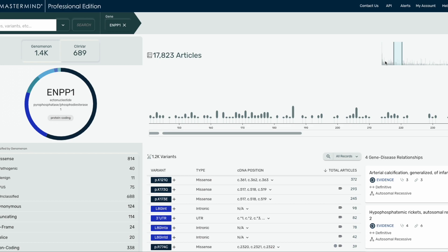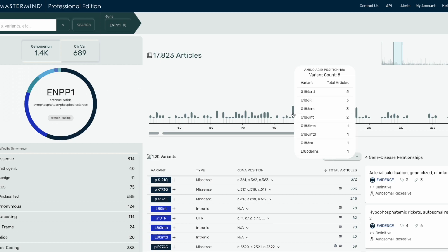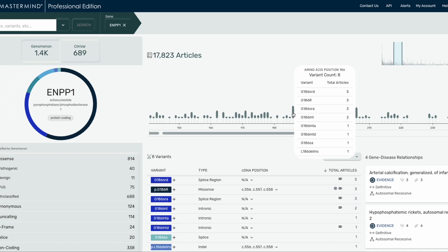You'll notice a smaller diagram in the top right corner — the highlighted area will show you where you are in relation to the entire diagram. The x-axis shows amino acid position, and the y-axis, or height of each peak, corresponds to the number of variants at that position and the top 10 most studied variants at that position, indicated by the number under Total Articles. If you click on a peak, all the variants at that amino acid position will populate in the variant table below, acting like a filter for this list.